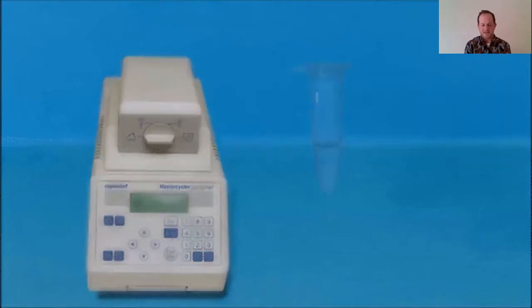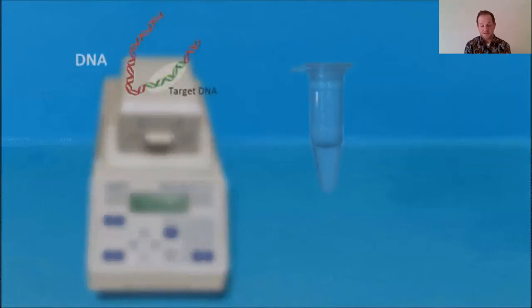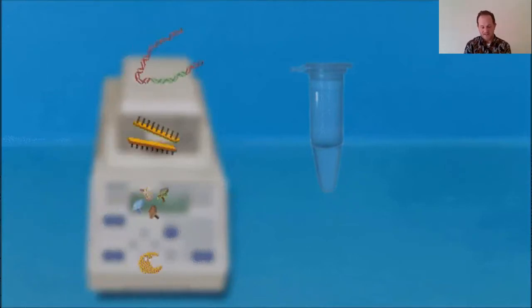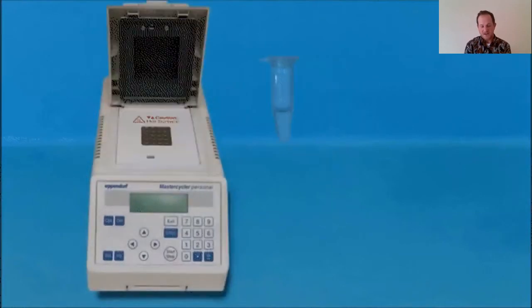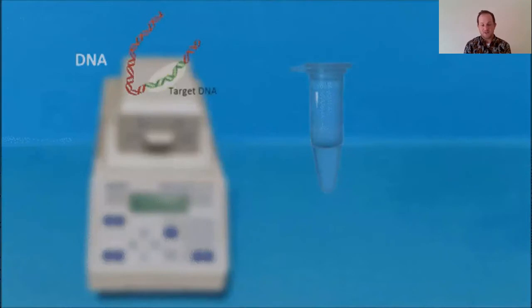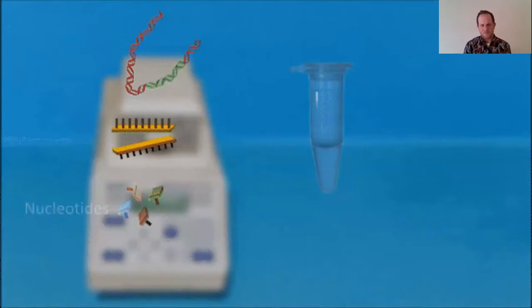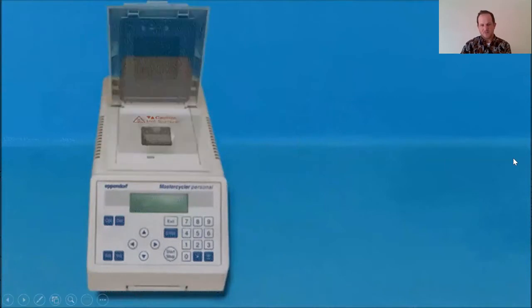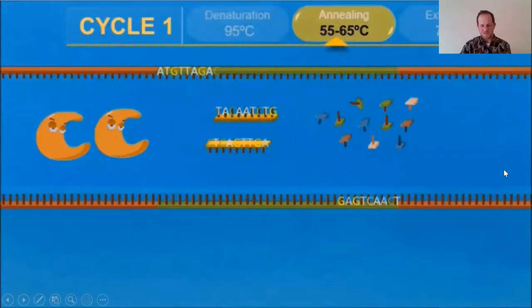So next we need to isolate and copy the CO1 gene fragment that is our DNA barcode. And for this we use PCR, polymerase chain reaction. PCR involves pipetting the purified DNA, primers, nucleotides, and the polymerase enzyme into a microtube, and then cycling this tube and its contents through a set of different temperatures in a PCR machine, which is also known as a thermocycler. So you pipette these into a tube and then put it into the thermocycler where it will be cycled through a range of different temperatures.